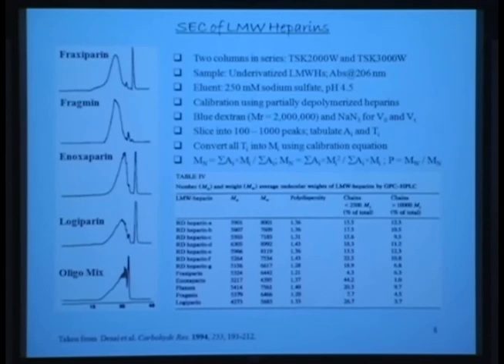Once you set up an Excel spreadsheet, okay, I mean, it's not difficult. I mean, come on, it's not difficult. What do we do? We basically take on the y-axis, not shown here, but on the y-axis, what is the y-axis here? It is absorbance, right? Absorbance versus what is the x-axis? Time. Now absorbance obviously is just direct absorbance.